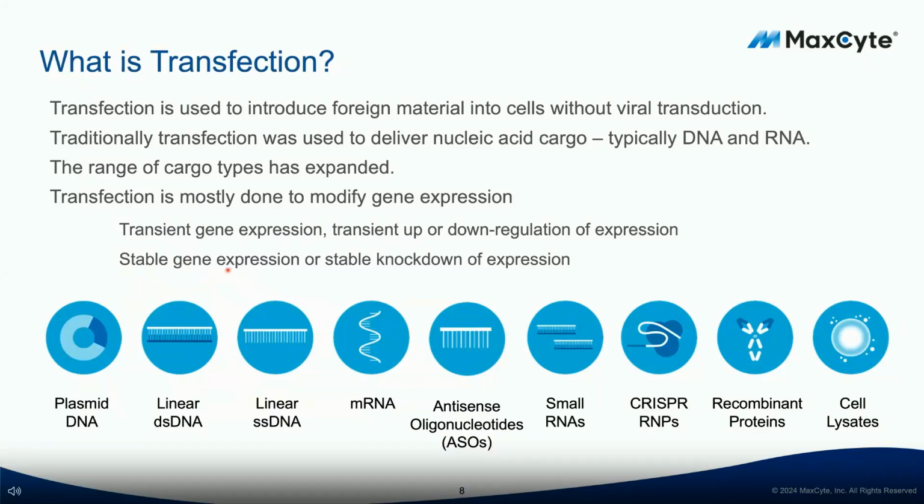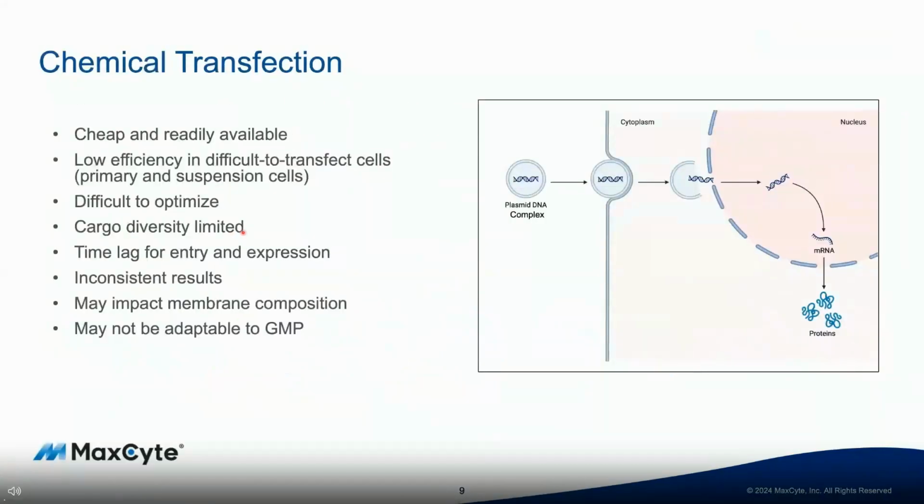that gene. So one common method for transfection is chemical transfection, where you would complex your nucleic acid with a positively charged molecule, whether that's PEI, for example, and that would interact with the cell membrane for endocytosis, and then there would be a release step for the DNA to be delivered into the nucleus and then expressing mRNA and protein.